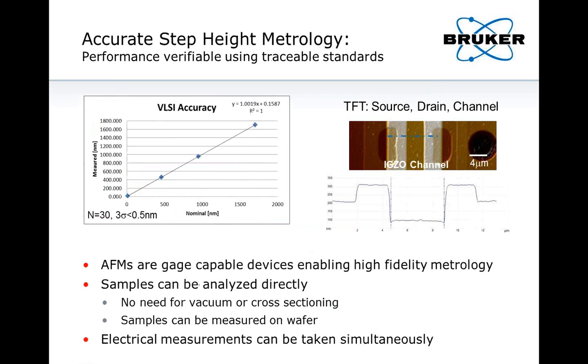Okay, AFMs are not only devices to give you pretty images, even though some of these images do look quite pretty indeed. They're actually verifiable against traceable standards. So they're gauge-capable devices, and that in turn enables you to do high-fidelity metrology. And one example is shown here.